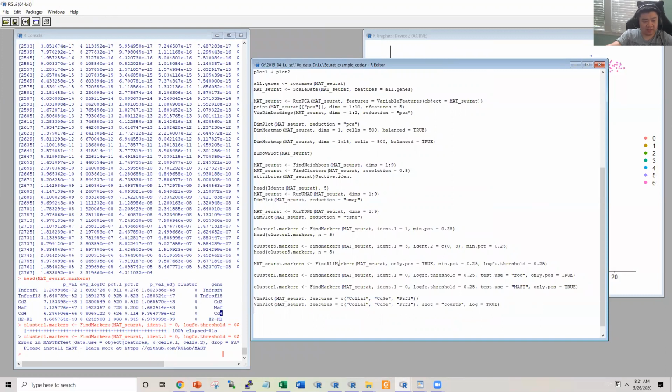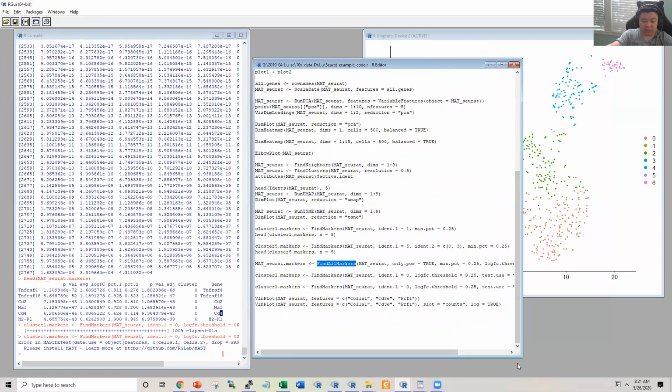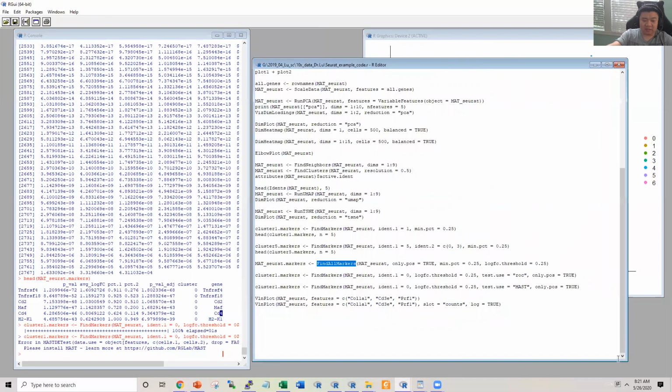So what we can say is that FindMarkers can identify the top markers, but a lot of markers can be biasedly identified, because Seurat uses methods that are relatively easy to conduct but are not correct for single cell RNA-seq data. Still, it's okay to show you the general characteristics of the data. But for very detailed feature extraction, especially if you are interested in a certain gene, you should definitely use a specific differential gene expression test to do the analysis.